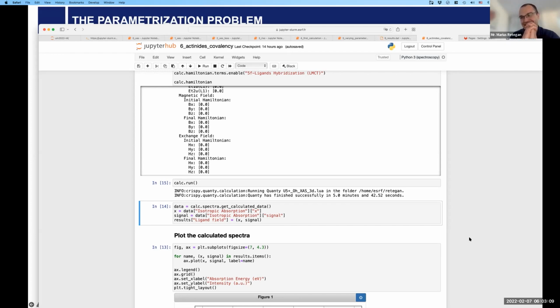It's MATLAB based, but with an Athena interface, so that people are not scared of it. That actually works. We do the PCA still out of Larch, and there's a MATLAB interface for MCR-ALS. This is what we are using. We implemented the same MATLAB MCR-ALS code, so that seamlessly you import the spectra, click a button, and get directly this MATLAB input, and the output goes back.